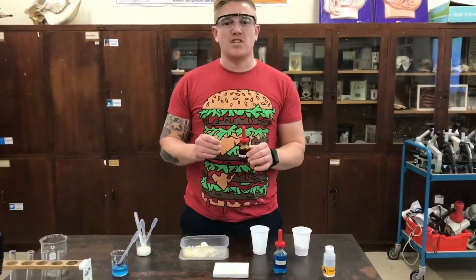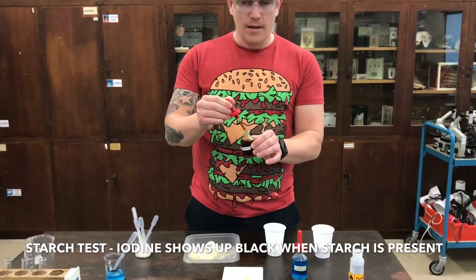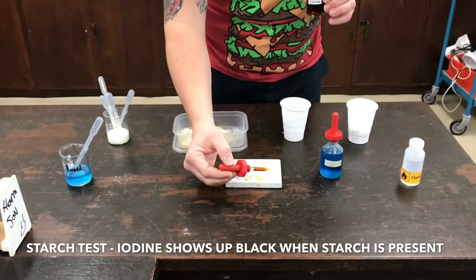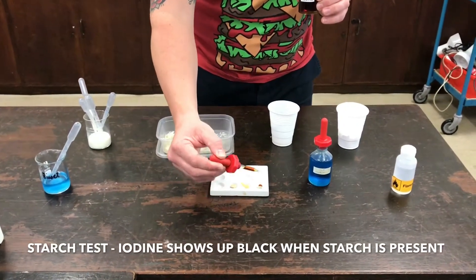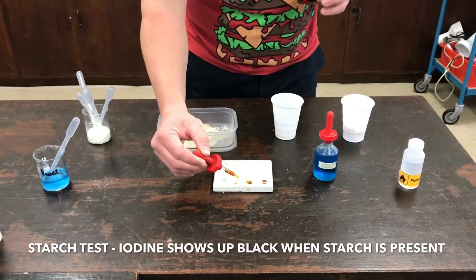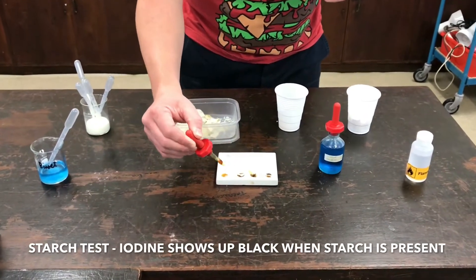First of all I'm going to test for starch. Starch is going to be tested through iodine. I'm going to take a drop of iodine on each one of my already prepared foods. As you can see I'm using a spotting tile just for ease of use. I could use a test tube, but for ease of use I'm using a spotting tile.